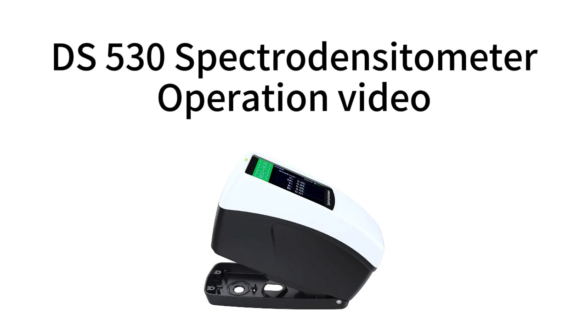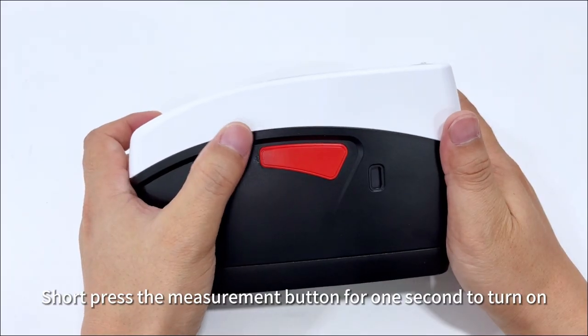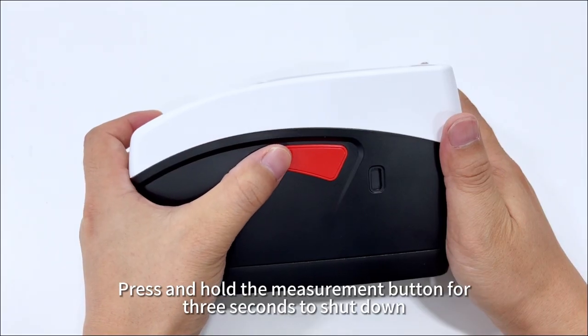DS530 Spectral Densimeter. Operation Video. Power on and off. Short press the measurement button for 1 second to turn on. Press and hold the measurement button for 3 seconds to shut down.